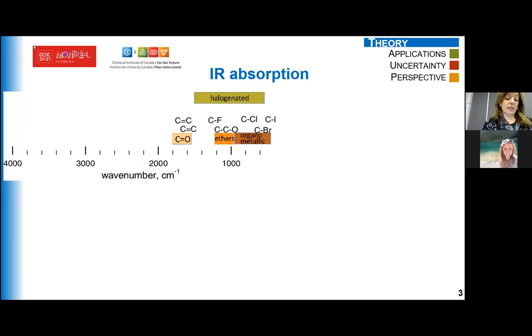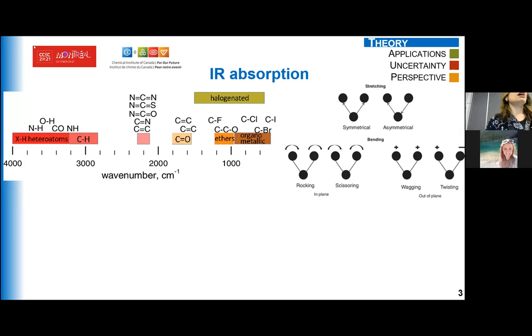As I said, this is like a fingerprint, because when we use IR to irradiate a certain molecule, this radiation is not enough to excite the electrons, as other spectroscopies do, but it is enough to modify the vibration of the bonds. That's the interesting thing that we can do with IR.